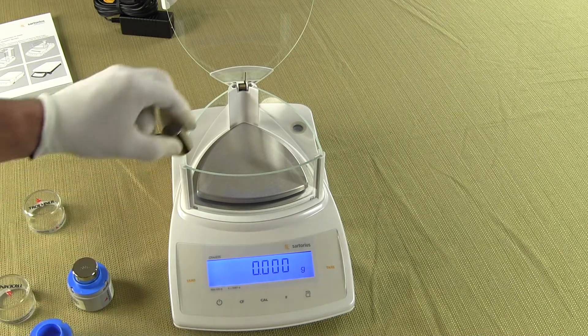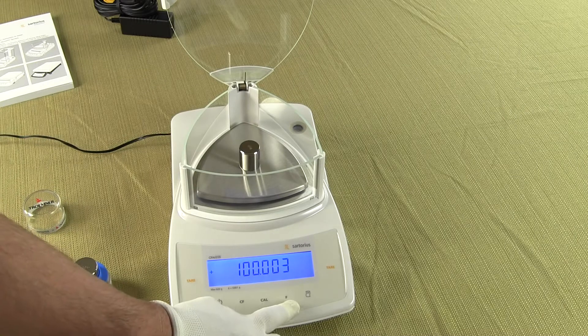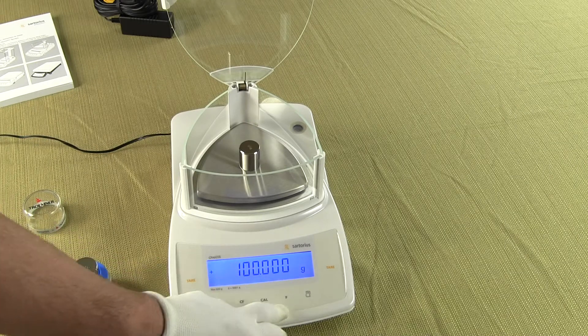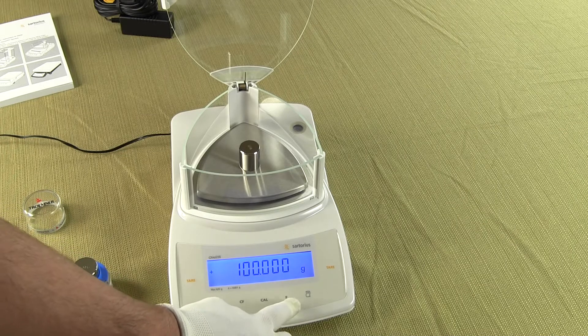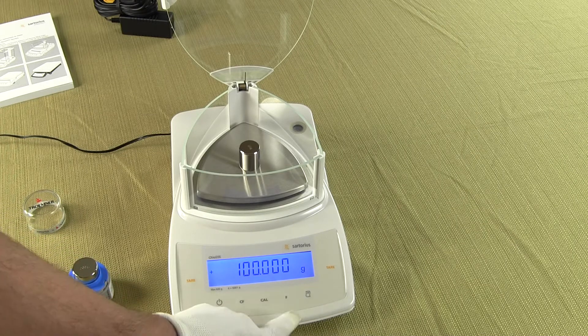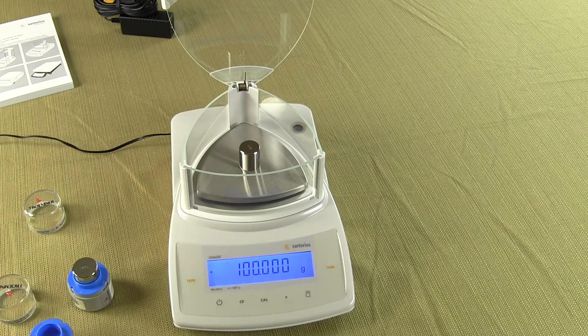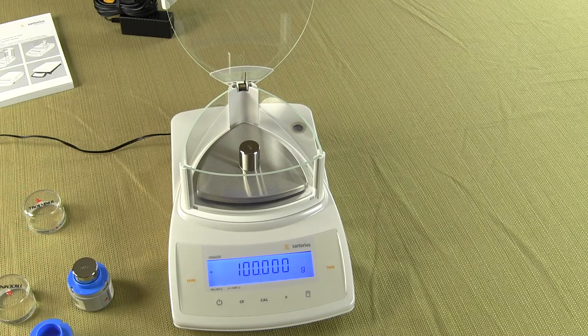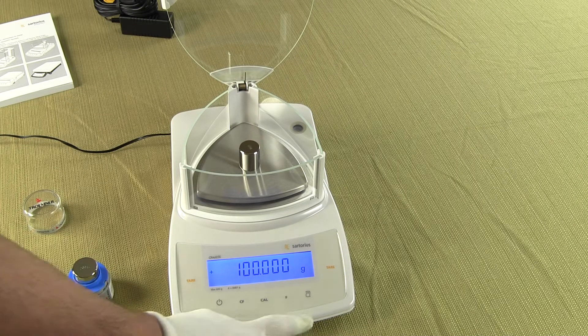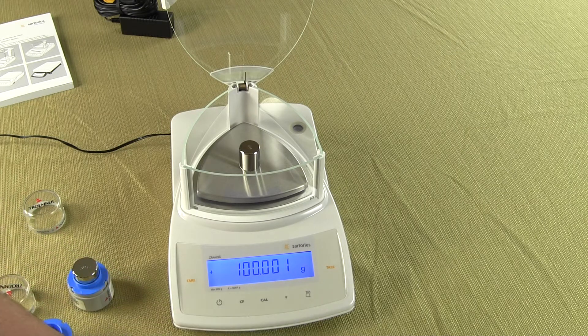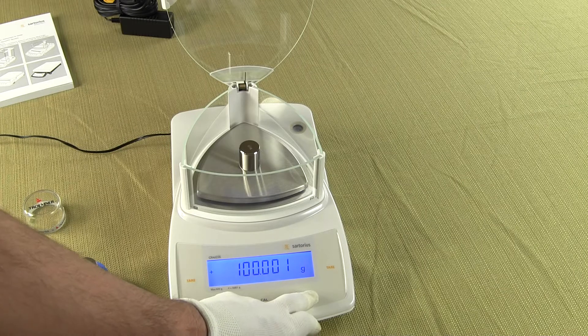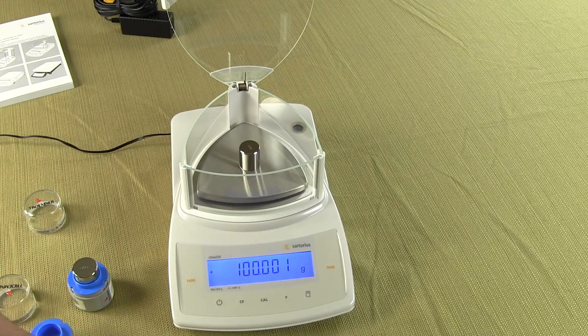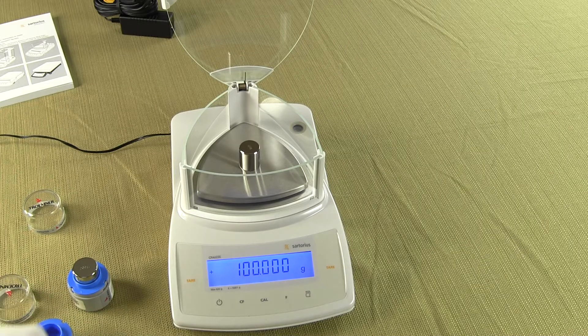The other functions would be you have an F key here, we could change the primary mode, right now is grams. If we set this up for a secondary weigh mode one simply presses the F key and it would switch. So you have about 13 different weigh modes you can set the balance up in. Out of the box the balance default is grams only. We also have all the way over on the right hand side we have the print key. This print key if one presses it would send the data to a PC or an optional Sartorius printer.